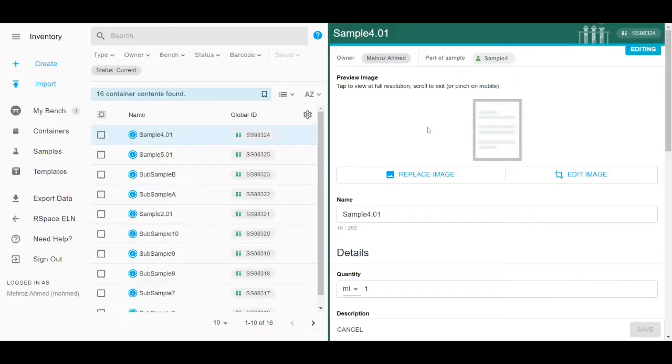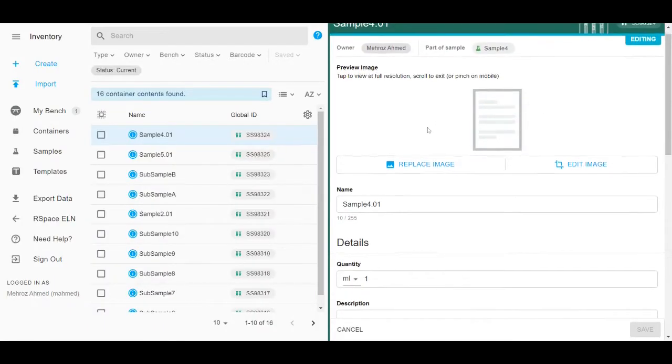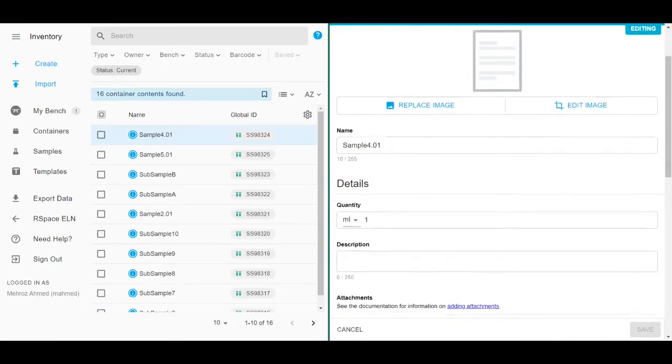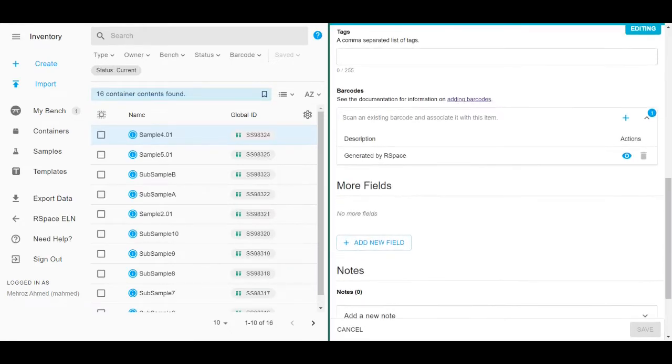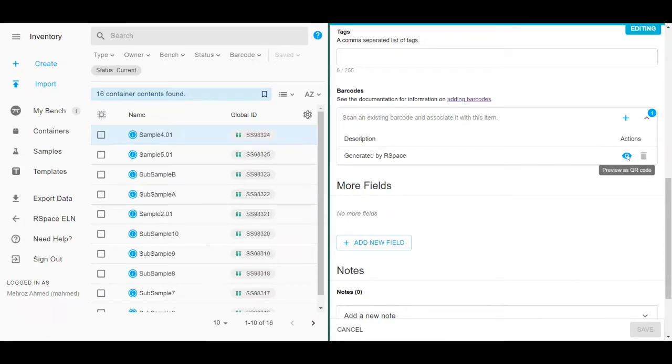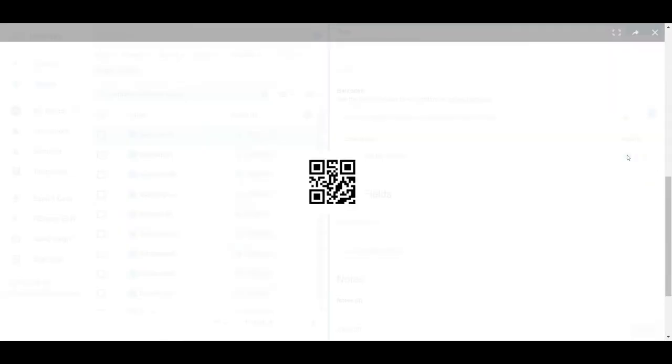Select your chosen sample, click Edit and scroll down to the barcode. Here, you'll see that there's a barcode, a QR code in fact, already generated by RSpace.